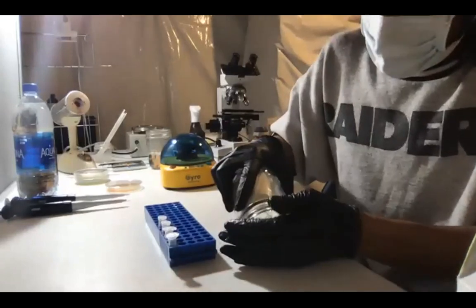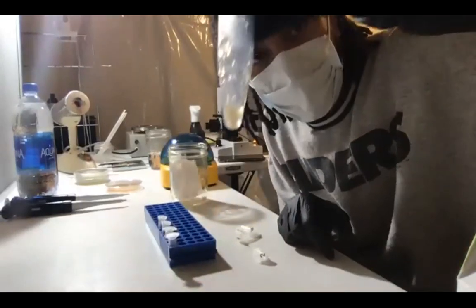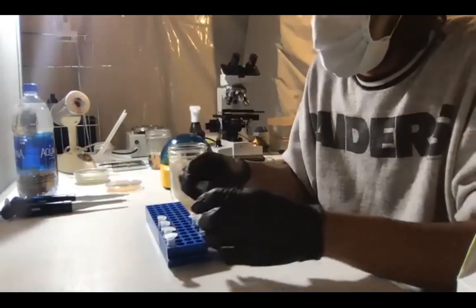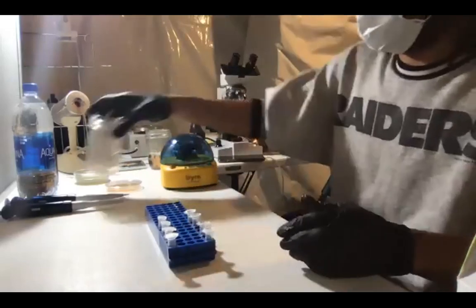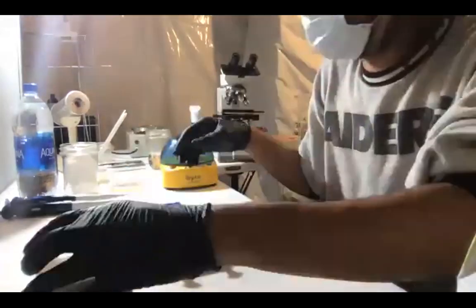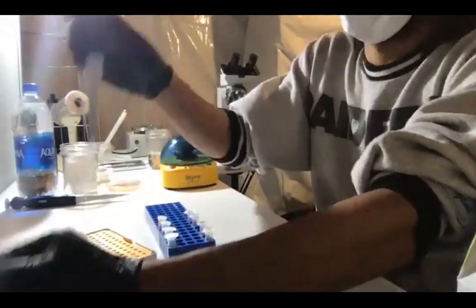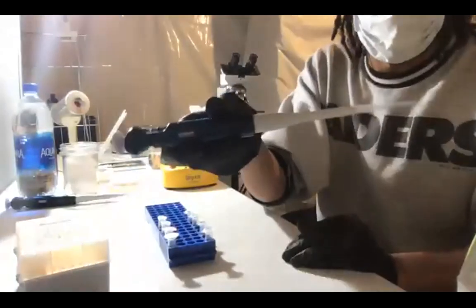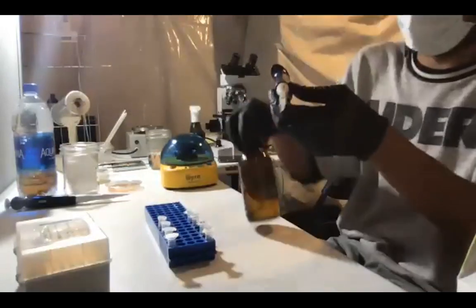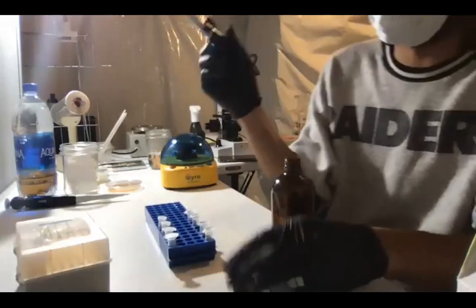And I'm just going to dump these out onto the table. So they're all heated up, and you'll notice that some of the agar is starting to melt a little bit, which is okay. And the next step is to take some of your 200 microliter pipette tips, attach your pipette tip to your pipette that's set to 100 microliters, and you're going to add the same amount of dilution solution as you did extraction solution. So I'm going to add 100 microliters of dilution solution.